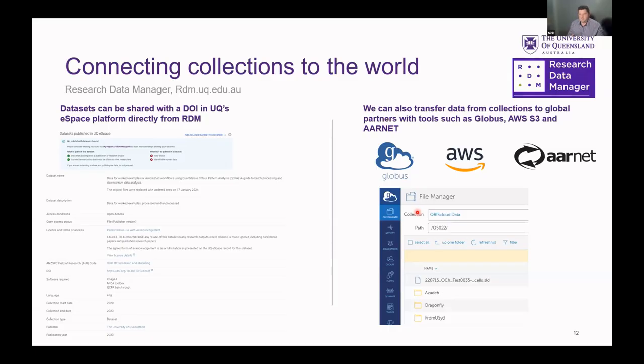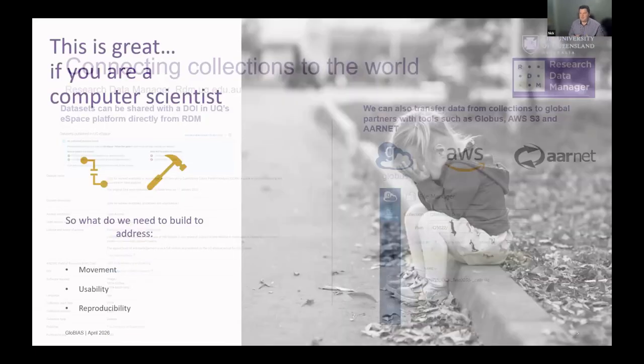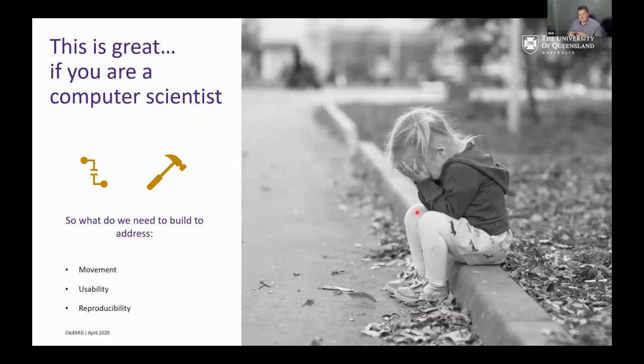So hopefully you can appreciate that this whole storage of the data is what I like to think pretty well solves on our end for our users. My users probably don't think the same way though. And that's kind of great because if you're a computer scientist and you deal with all the command line and stuff, it's really nice. We have got some tools for Windows to make it a bit easier so they mount automatically on microscope computers for them and things like that. But we do need to keep building tools that will address this movement of data, making sure the infrastructure is usable and that it's reproducible.